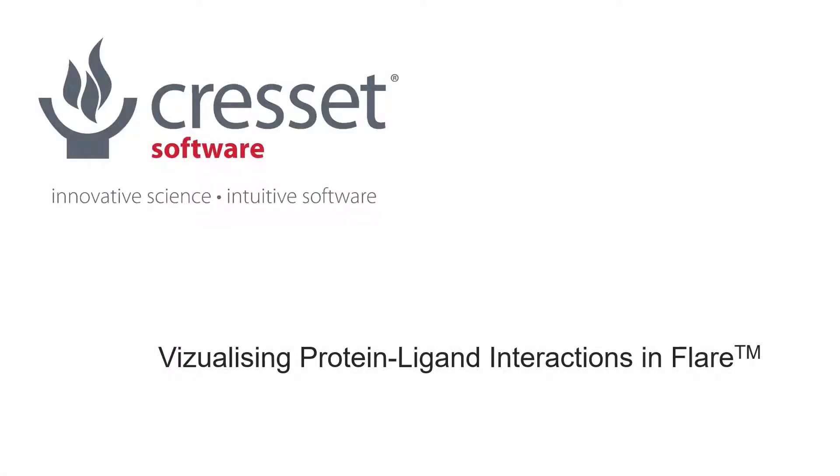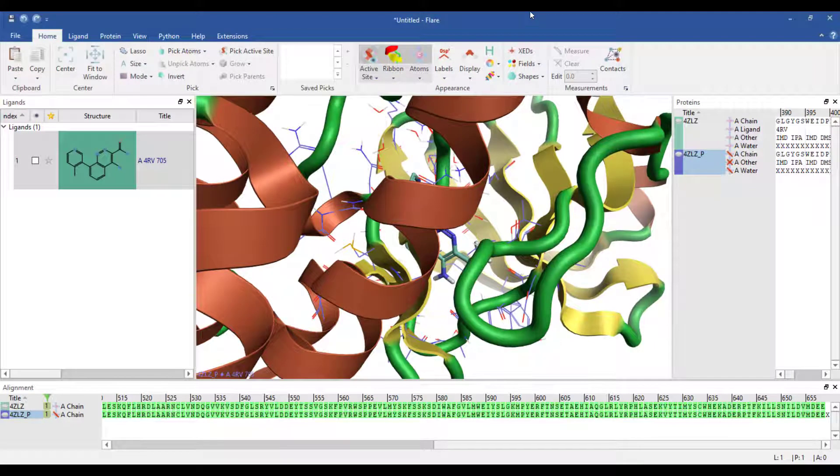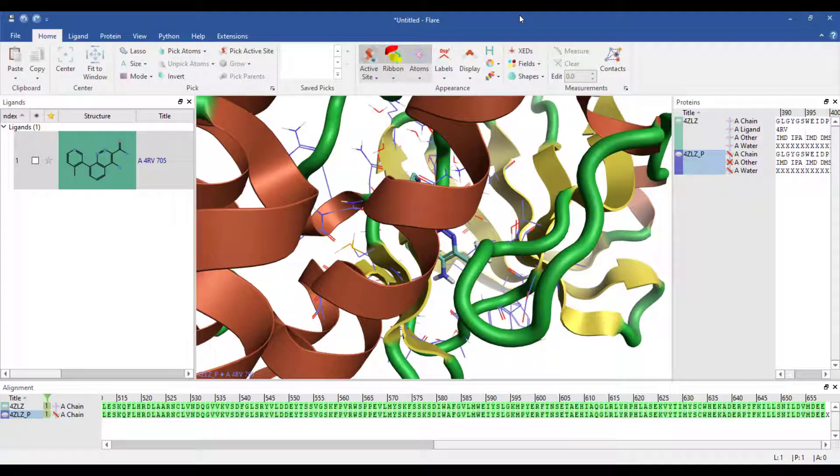In this web clip, I'm going to explore some of the functionality in the Appearance section of the FLIR ribbon and show how to view contacts between a protein and ligand. I have loaded PDB Entry 4ZLZ into FLIR and I have fully prepared the protein and ligand.